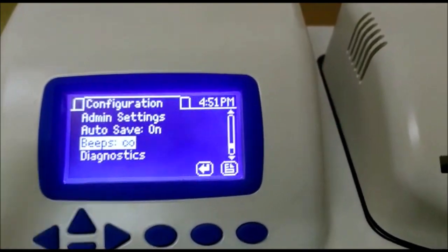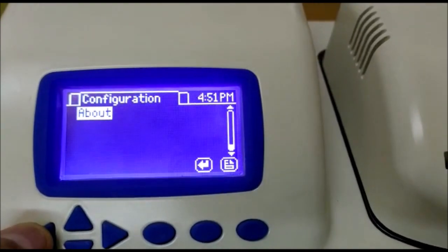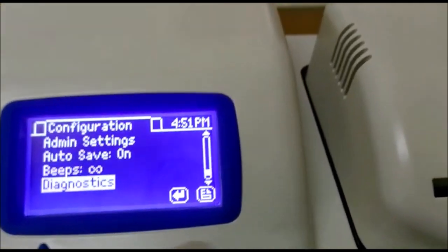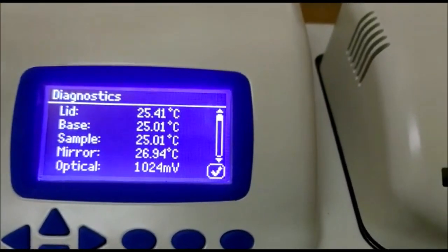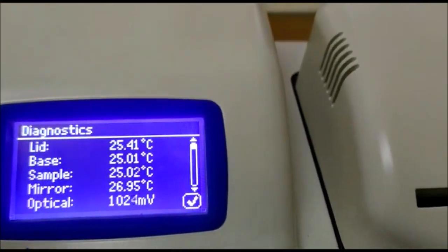Once the test is completed, the instrument gives beeps and you can select those also. Diagnostics will give you the health of the instrument and how it is performing. If anything goes wrong, you will see it in the diagnostics window.